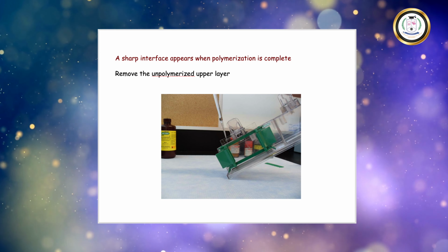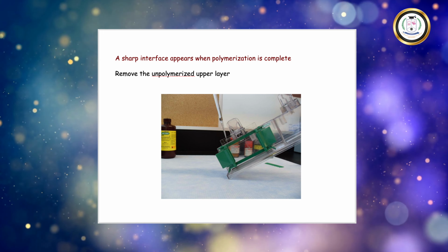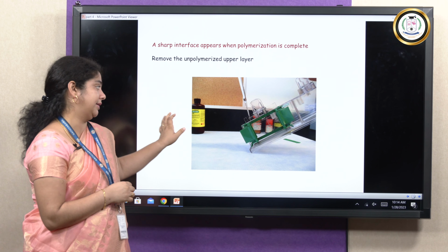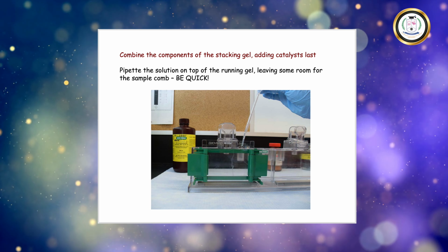Then the remaining water can be removed once the polymerization is done. The polymerization takes even 20 to 30 minutes. Then once it is done, we can pour the stacking gel.